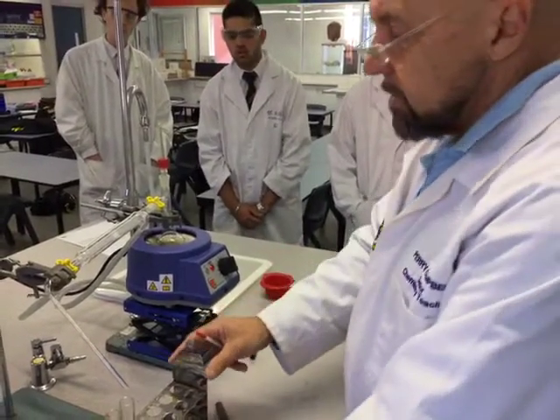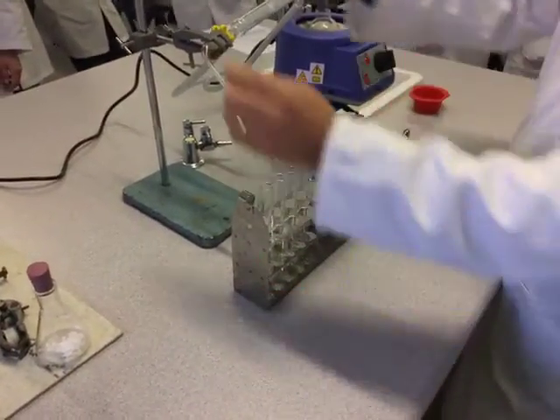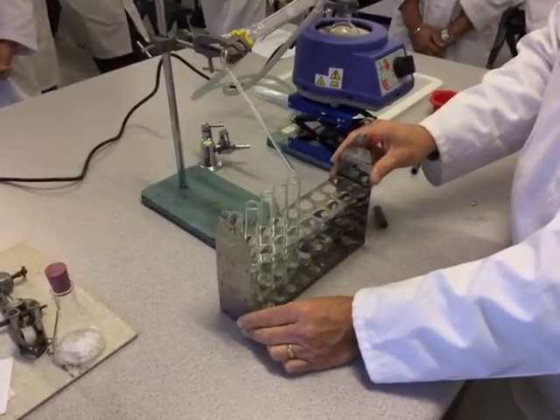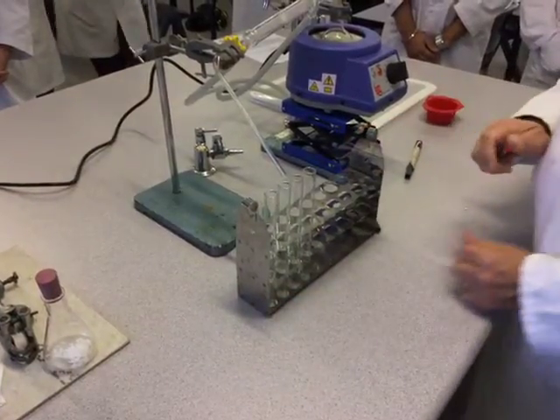The other thing I forgot to mention: over here we've simply got our test tube rack, and all we do is move this along as we are collecting each fraction. It should be fairly obvious.